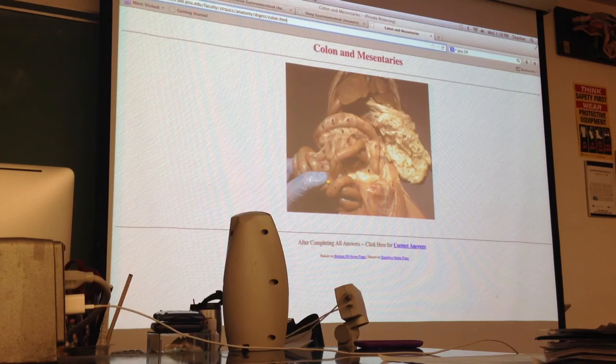That's kind of a hard thing to decipher, right? Especially if it's not going to be perfectly in line in the cat's abdominal cavity. So if I were explaining this or showing this to you, I would call all of this the transverse colon, just because there's such a small part of that ascending colon that it's really not even worth mentioning. So I would just say all transverse colon.